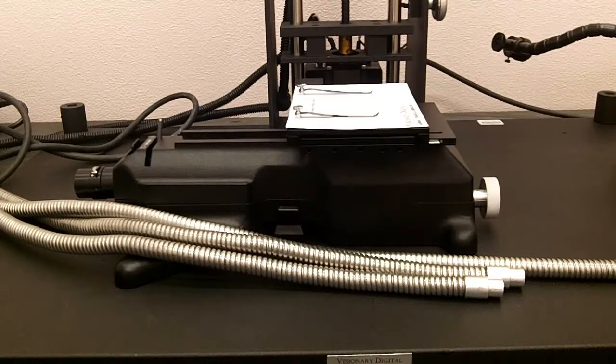So here is the Visionary Digital SolMate Transilluminator, which basically acts as a microscope base for imaging specimens on microscope slides or other very small specimens, or something that you need to show the see-through quality of that specimen. So the SolMate is used in conjunction with fiber optics.